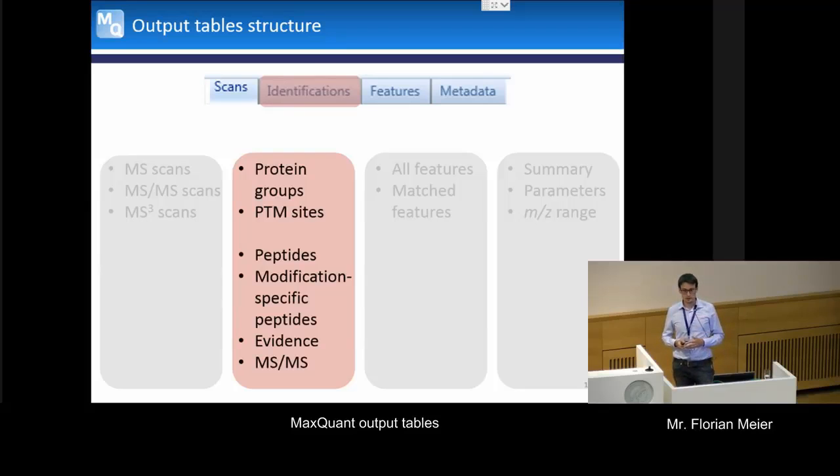underneath this level. So if you think about it, we have proteins, and all of those proteins come from peptides, and then every peptide needs to have an evidence. An evidence could be a single MS event, it could be a match feature, but it can be several evidences for one peptide. And similarly, you can have several MS events that were identified for one feature. So it's like a cascade. We can have a lot of MS events, and then they turn into evidences, and those evidences are then turned into peptide identifications. Peptide identifications infer protein identifications.